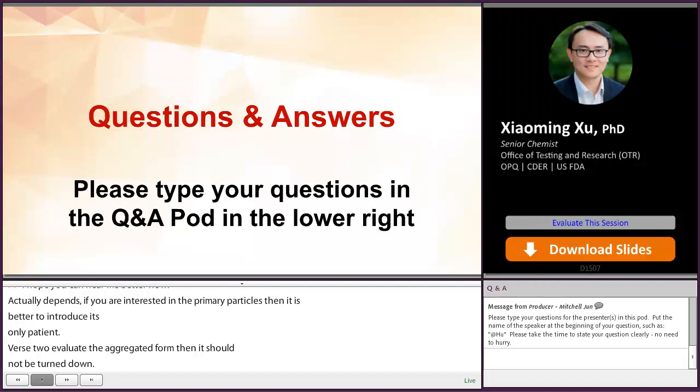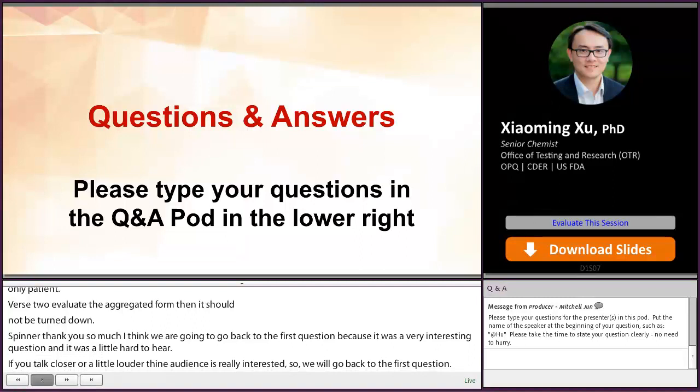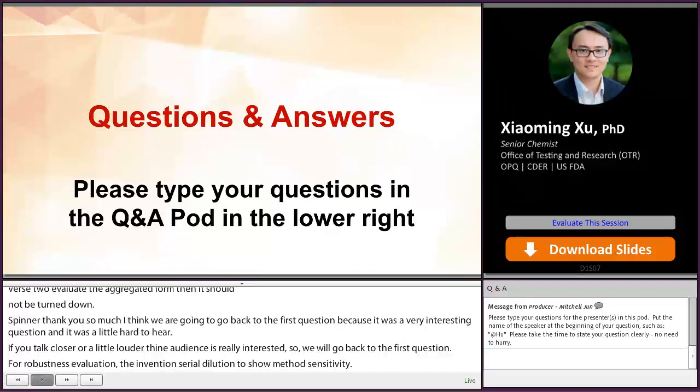Great, thank you so much. And I think we're going to go back to the first question because it's a very interesting question and it was just a little hard to hear. If you talk closer or a little louder, then I know our audience is really interested. So we'll go back to the first question. For robustness evaluation, you mentioned serial dilution to show method sensitivity. Is that for a specific method or a general expectation? What about laser diffraction where you typically don't pre-dilute the sample? Do we still need to do serial dilution studies?